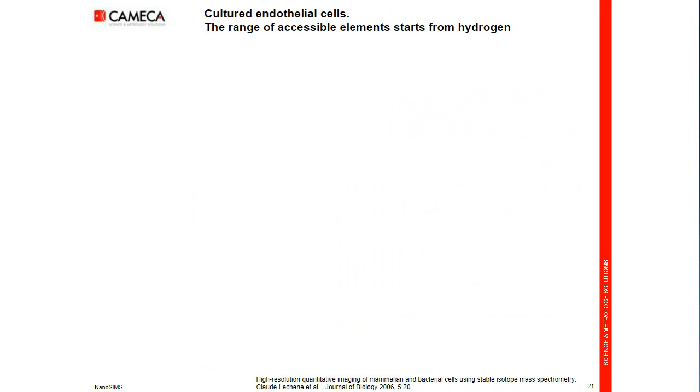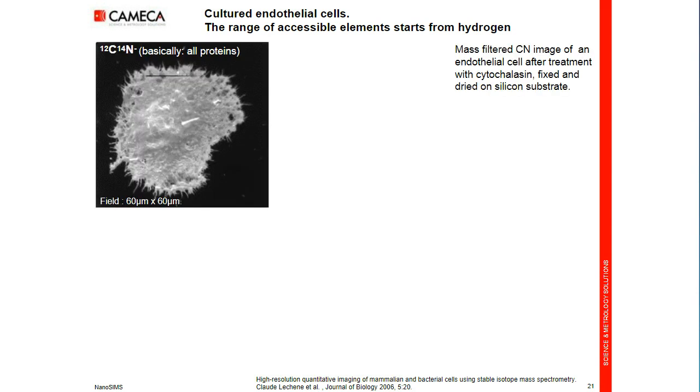One of the unique points of SIMS is its capability to analyze hydrogen and deuterium. So I will illustrate this using a scientific paper by Claude Lechene, working with the NanoSIMS at Harvard Medical School. Here you see an endothelial cell imaged through the ion CN-, imaging proteins.